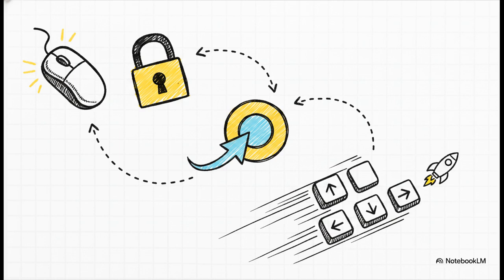controls. You can just double-click anywhere to lock your zoomed-in location. If you wander a bit too far off, no problem. Just hit the jump button to instantly snap your view back to one of those saved colored markers. And if you need to travel vast genomic distances quickly, holding Shift while using your arrow keys increases your panning speed by 10 times. It makes exploring incredibly fast and efficient.